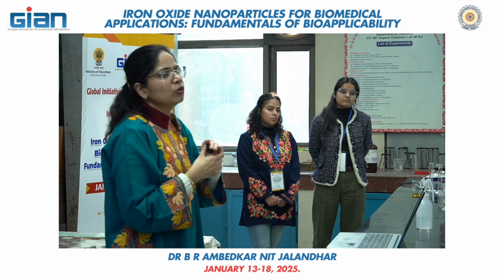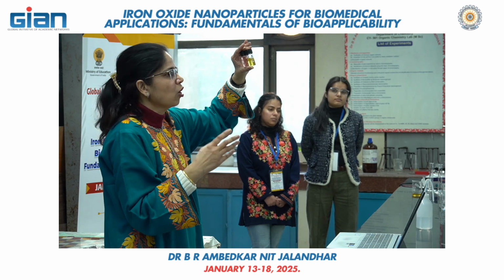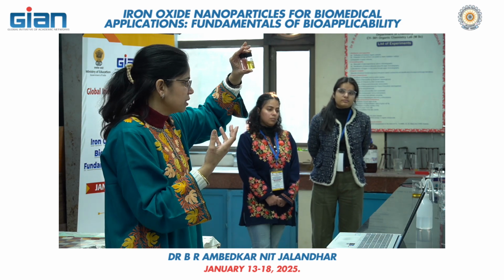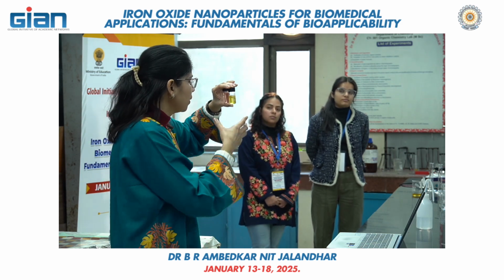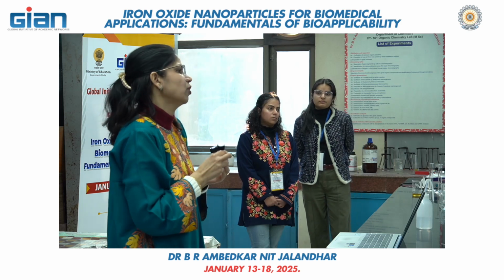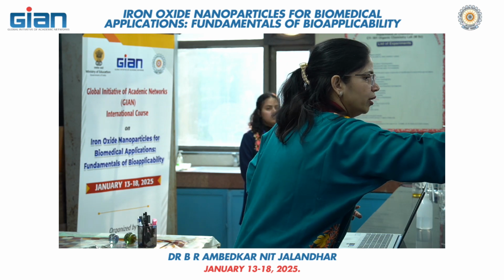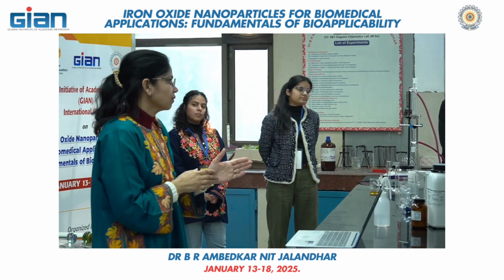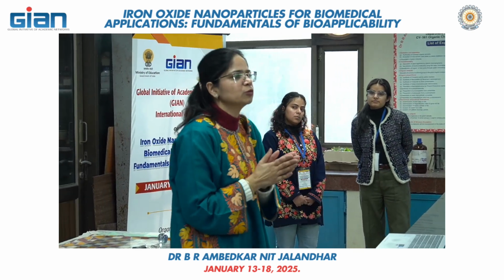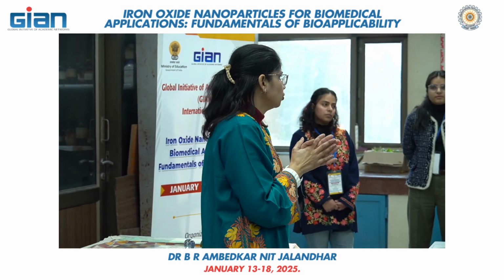And similarly, you can use these nanoparticles for the other applications, for the biosensing, optical sensors, electrochemical sensing, or you can synthesize the nanocomposites. So you can read more research papers, get more ideas for their applications. Okay. So keep this sample and store it. We will use it. Okay. So now the synthesis you have done, the characterization you have done with the UV spectroscopy. Take the data, and now you can plot the Tauc plot and get the value of the band gap.